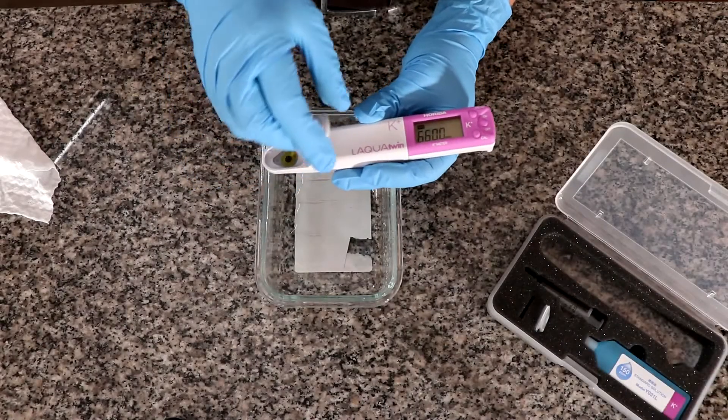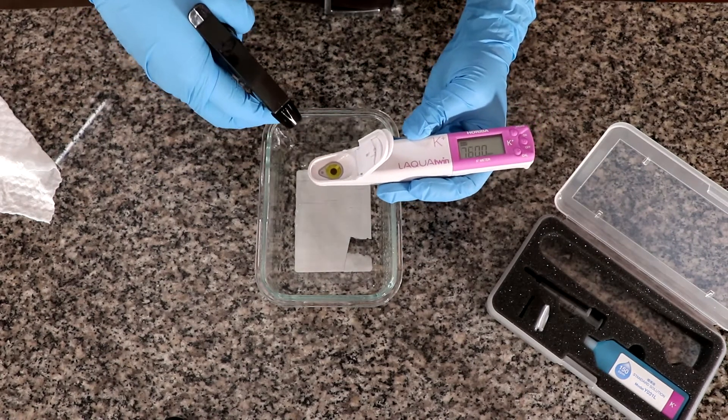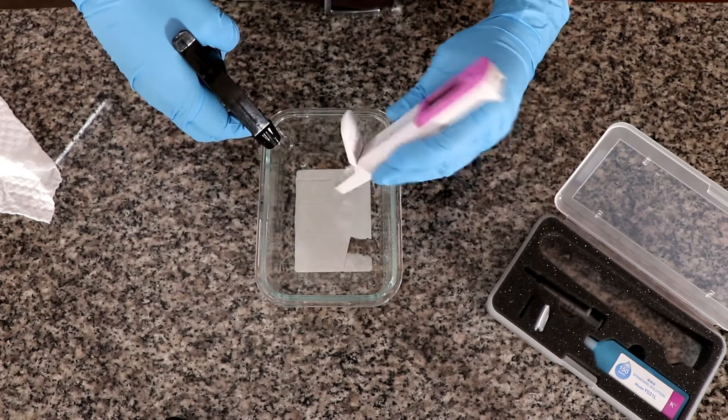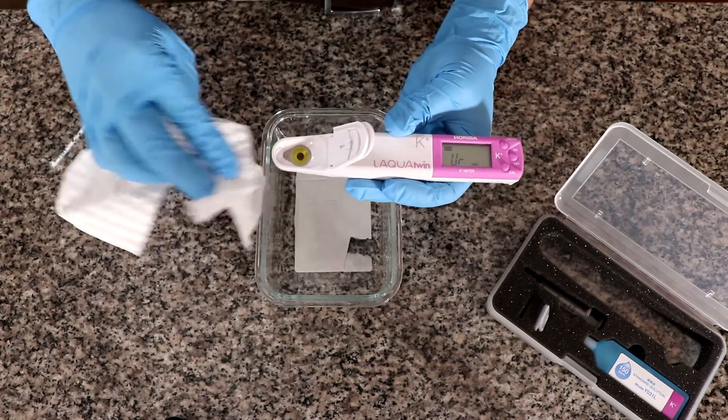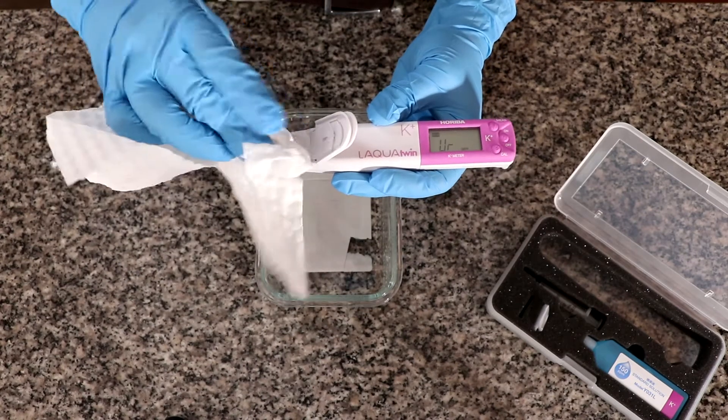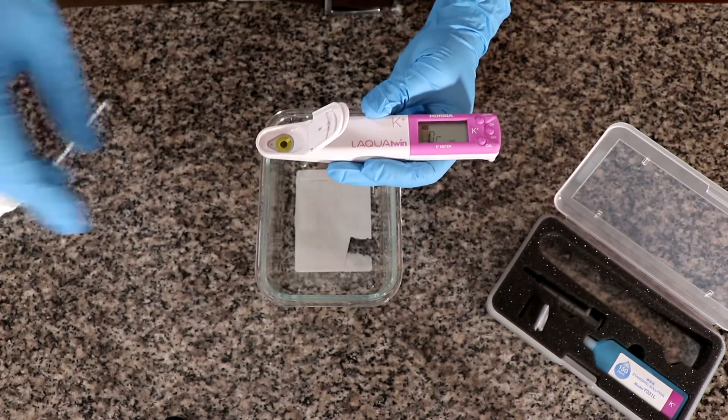Now we're going to perform the calibration process. You switch it on then we're going to use distilled water to wash the sensor receptacle. Then I'm going to use a paper towel to tap this very lightly to ensure there is no remaining solution there.